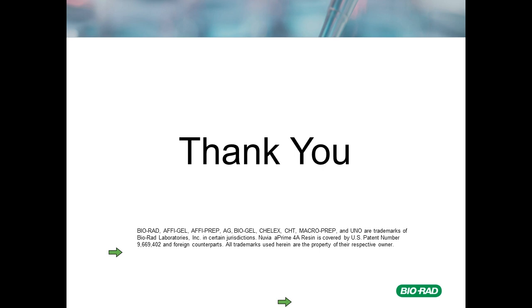Okay. And what are the pros and cons of using ion exchanger versus CHT for vaccine purification? That's a great question, and it's kind of a long answer. A priori, it's better to use ion exchange as the first step in almost any process, with the exception of perhaps monoclonals, because they tend to be much more robust and survive harsh cleaning better than some other resins.